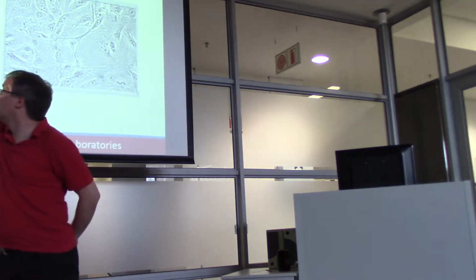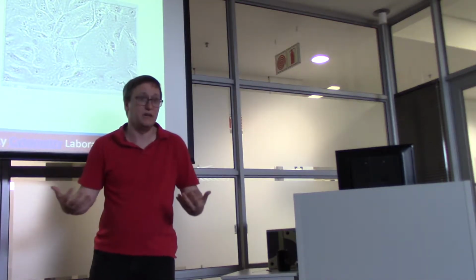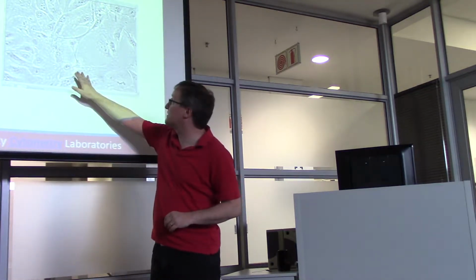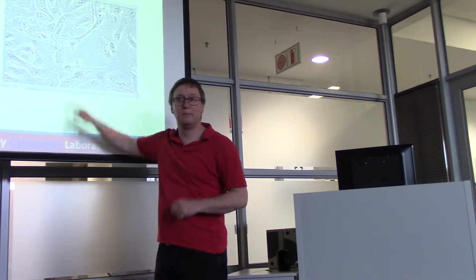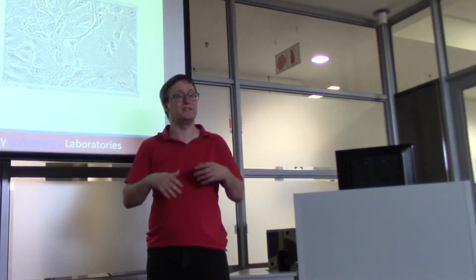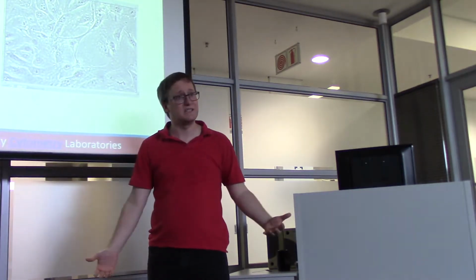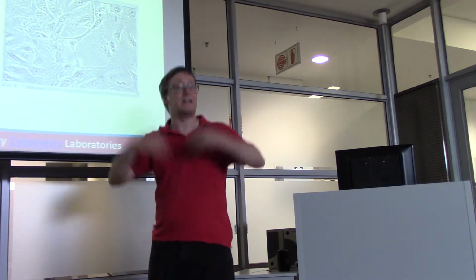We're just saying that the darkest pixels will now be called black, even though they were only dark gray to begin with. Now the result is that suddenly we have a much better contrast in the image. You can imagine that if you were to take a family photograph on a rainy day like today, you might have an awful lot of gray and muddiness in the picture. And if you want faces, the people to stand out against the background, you can change this brightness and contrast function so that that's optimized.